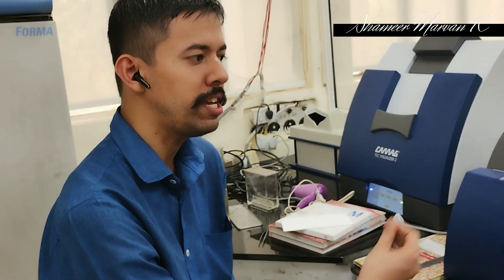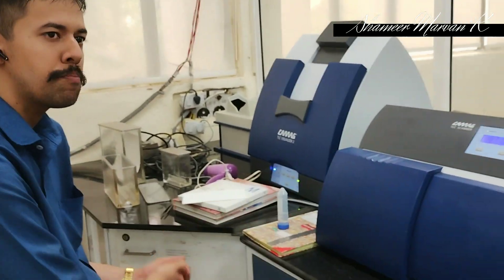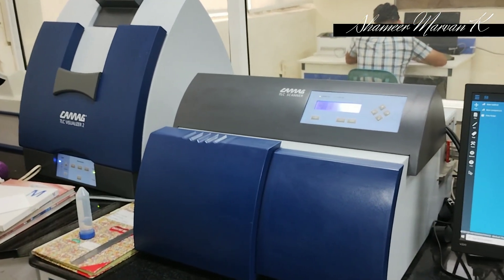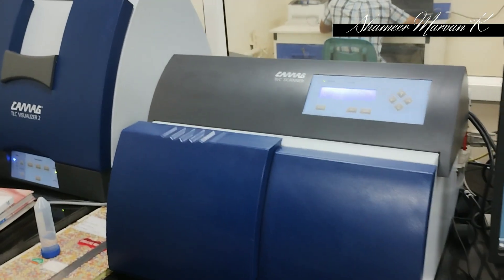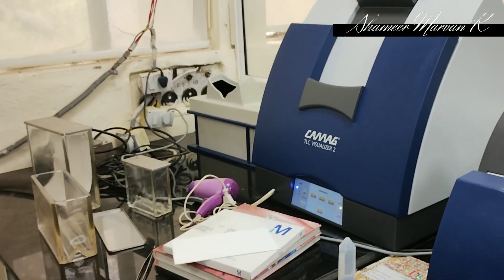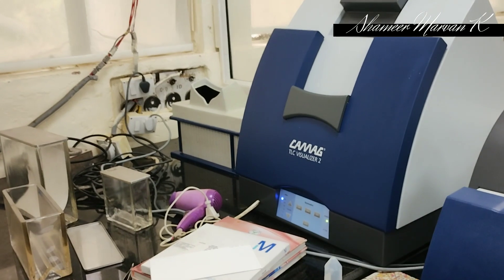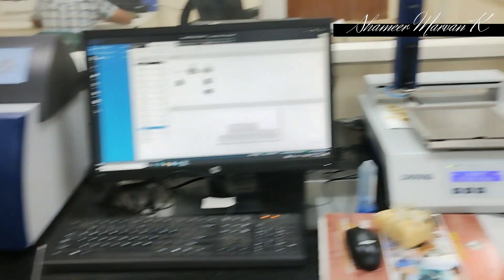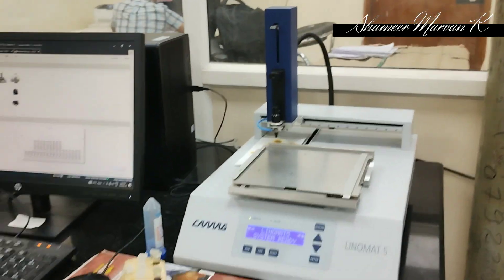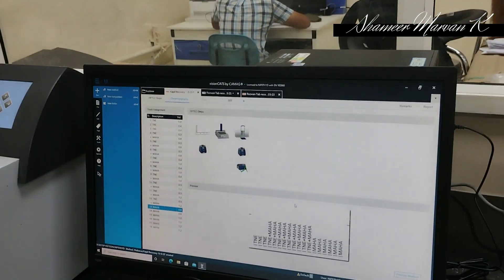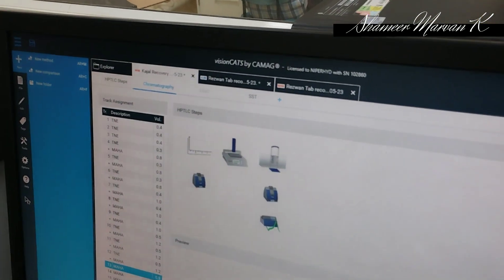A typical high performance thin layer chromatography instrument has several parts. Here I am explaining what those parts are. A typical HPTLC instrument includes a visualizer, technically called the CAMAG TLC Visualizer 2, a TLC scanner, a Linomat 5 applicator, and it is connected with software. The software name is VisionCats by CAMAG.